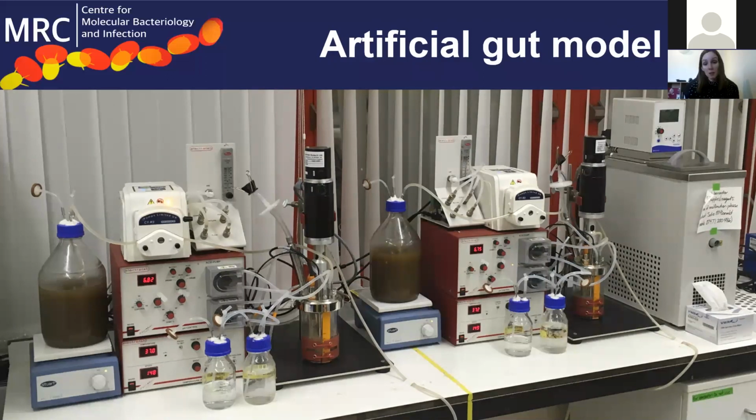Some advantages of these models are that they're very tightly controlled. We're tightly controlling the pH, temperature, speed of the growth medium, and even the composition of the growth medium. So we're going to have fewer confounding variables, as you might see in studies of humans, because one of the factors that is really difficult to control in humans is diet.